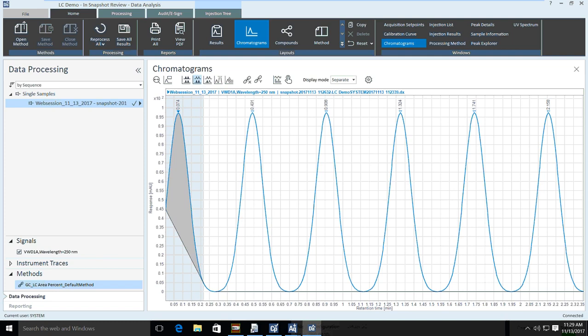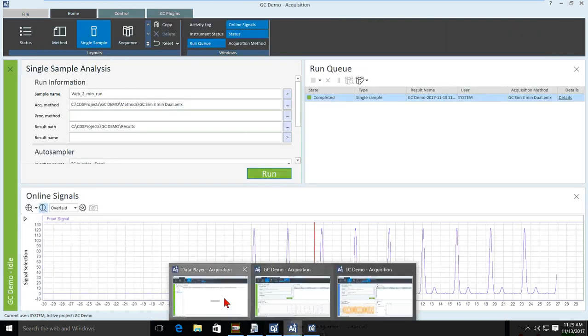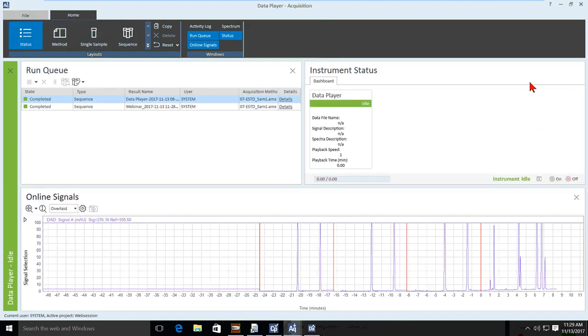All right, there's GC demo still going there. And that is done there. All right.